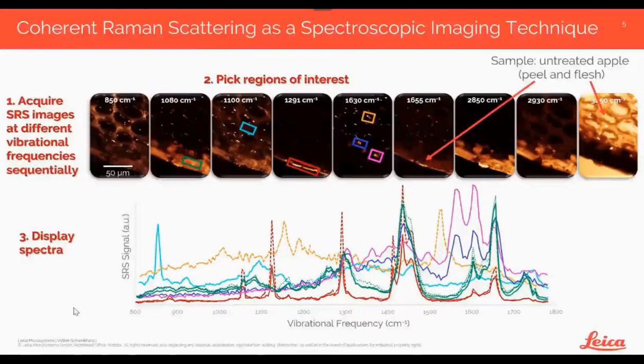And so it turns out that the powers that we use for coherent Raman scattering microscopy are actually perfectly suitable to excite second-harmonic generation signals and or two-photon fluorescence signals at the same time. So it rarely occurs that we have to change laser settings between acquiring the coherent Raman data and acquiring these additional multiphoton modalities. So these can typically be taken in the same image run.